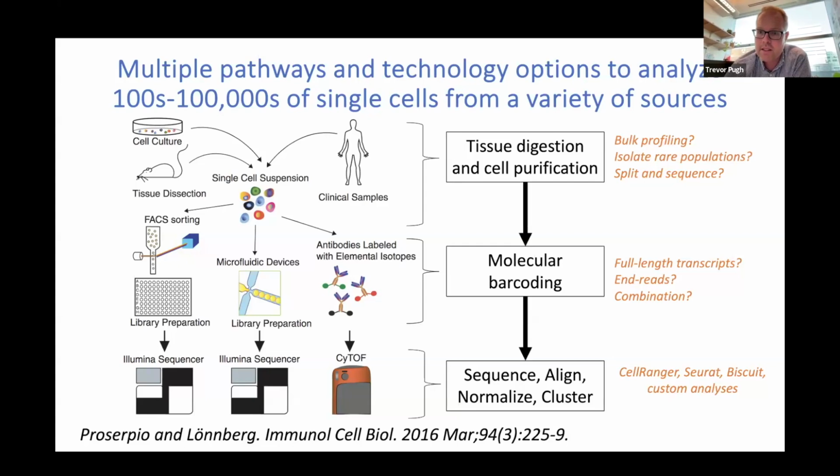And these parameters, some of the questions I put in here in orange, really come out in the quality control data. One of the most famous metrics is mitochondrial content. If you have very high mitochondrial content in one of your cells or across all your cells in the experiment, it's often, but not always, a sign of degradation. Your cell is essentially dying. You're not actually getting the cytoplasmic RNA. You're just looking at the RNA from the intact mitochondria. So sometimes that is an indicator that something has gone wrong upstream.